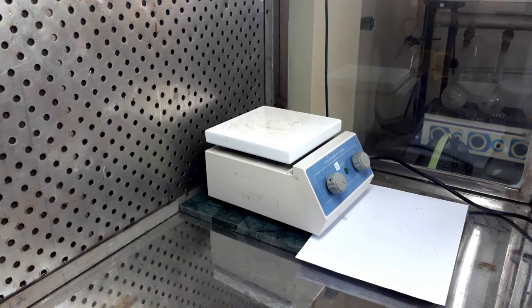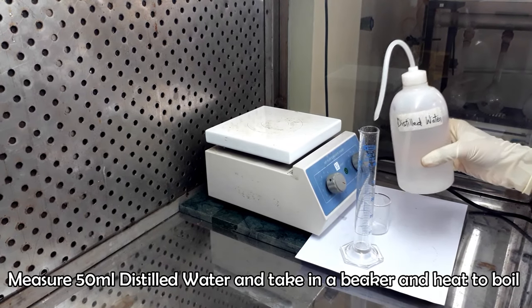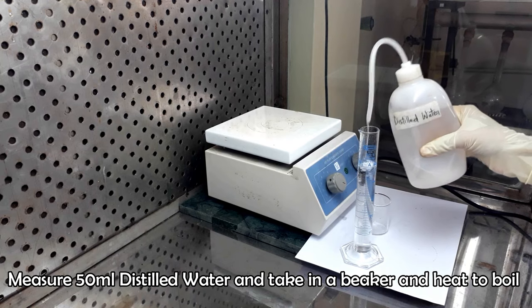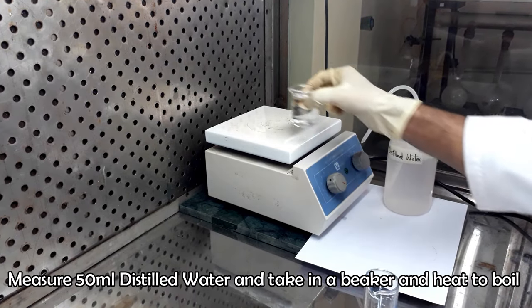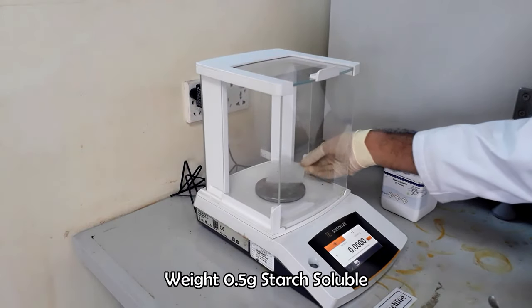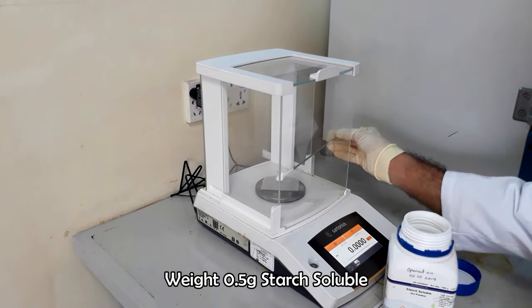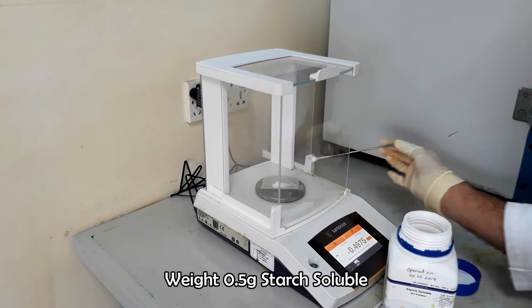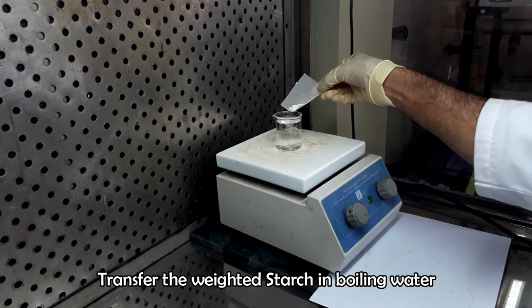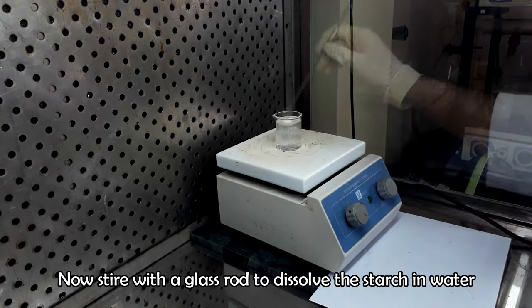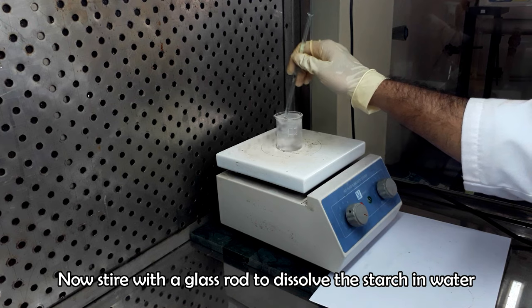Now we are going to prepare 1% starch solution. Measure 50 ml of distilled water and take it in a 100 ml beaker. Place the beaker on a hot plate and heat the water to boil. Take the weight of 0.5 g of starch soluble and transfer it into the boiling water. Stir the solution with a cleaned glass rod while boiling to dissolve the starch in water.